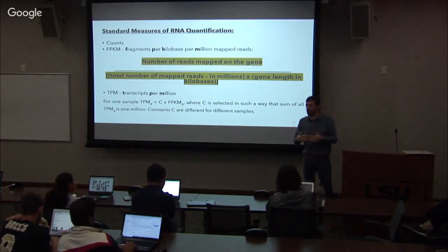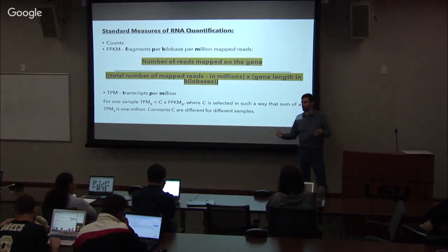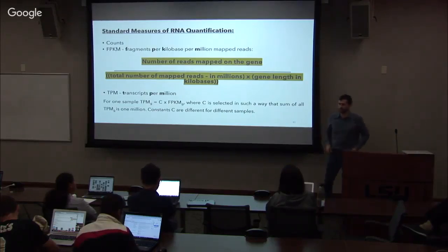And so you have a higher confidence in the actual sequence of that read. That is the major benefit. And then the analysis changes a little bit in terms of how exactly you combine, because they're not the same read from the same side, they're from two different sides. But it gives you also a better sense of that segment's beginning and end. So yeah, there is an advantage.